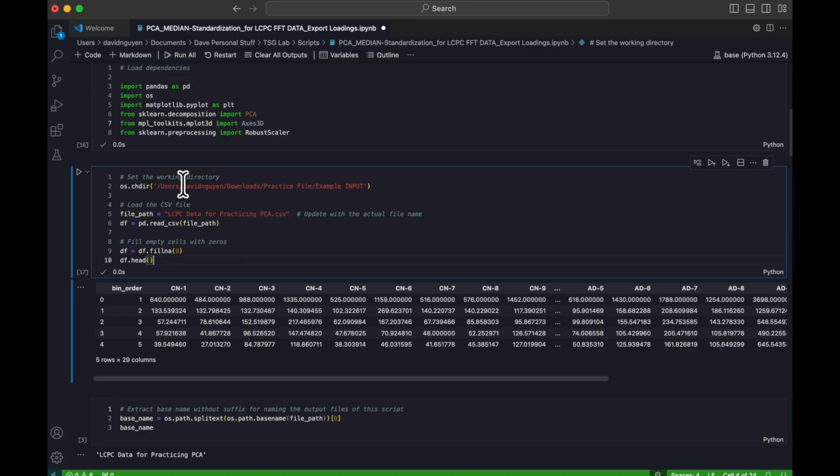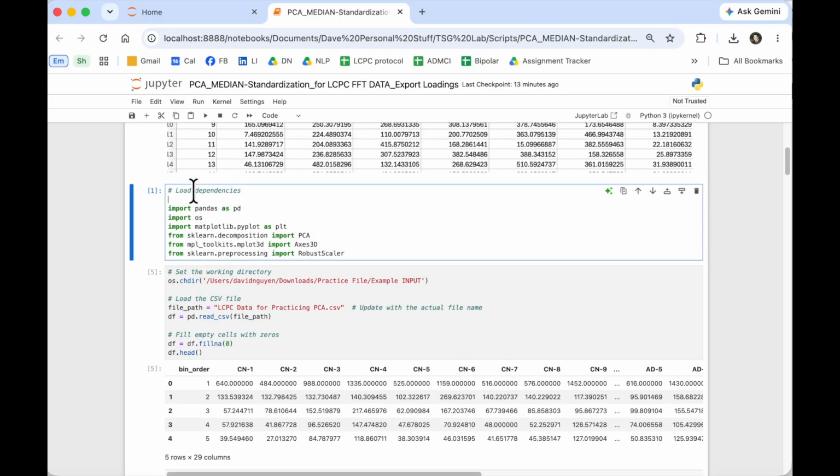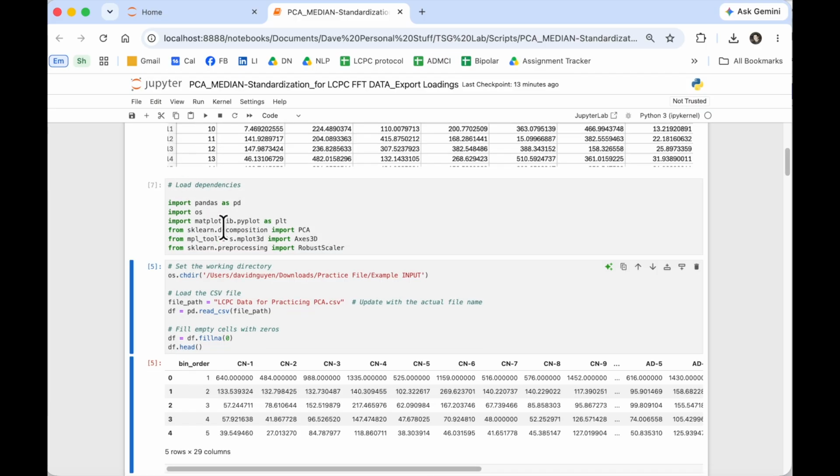Now this is Visual Studio Code. Here's a button called Run All. So you click it, it'll run. If you are in Jupyter Notebook, first you would run this cell. I click in here to activate it, and then I click this play button. It loads. I have all my libraries. Next, I paste in the information needed, the file path to the folder, and the name of the exact file in the folder I want to load.